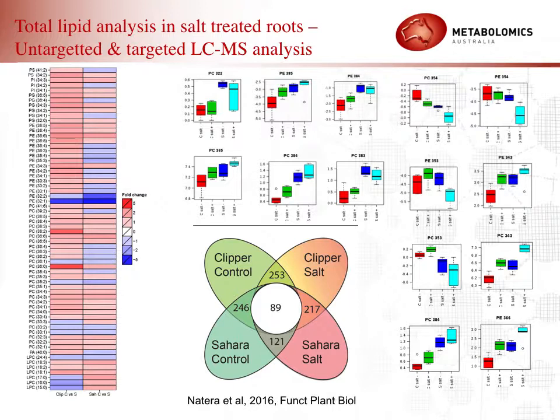Also, the box plot I'm showing clearly shows the fold change of some lipid species, and we have noticed most of the lipid species are changing due to the salinity, accompanied with more double bonds.